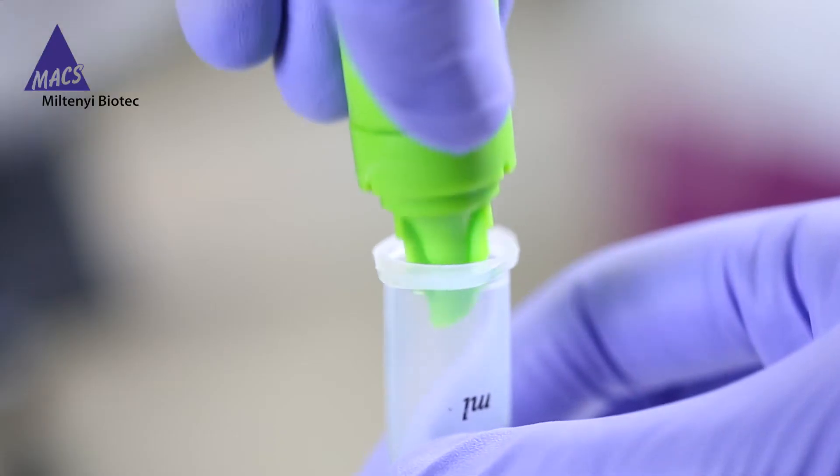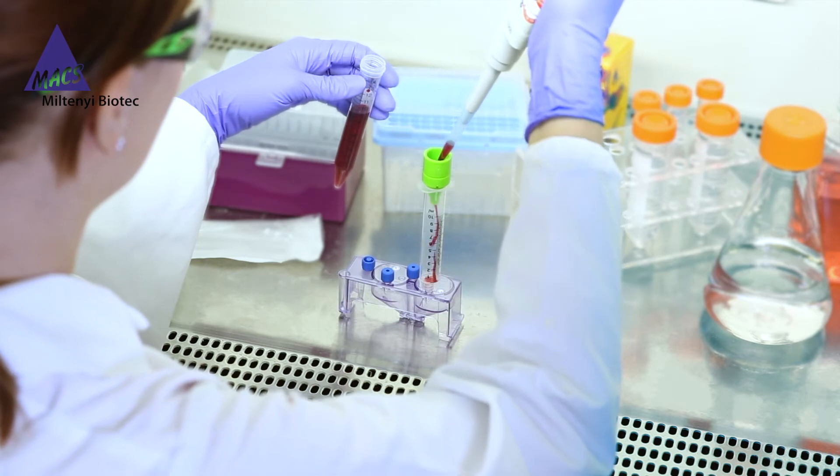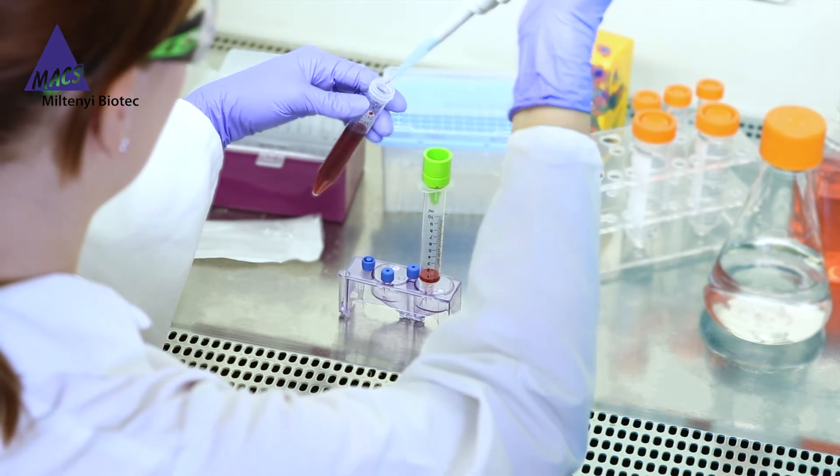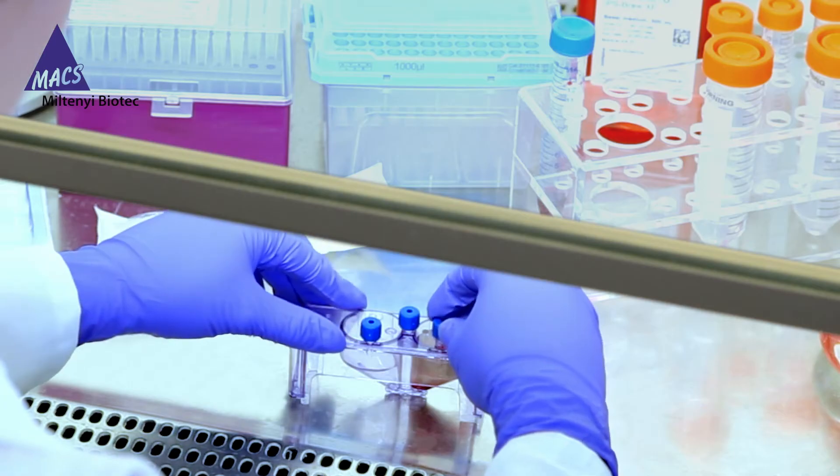Before the sample is applied, a pre-separation filter is placed on top of a syringe. To maintain sterility, you can load the cartridge under a laminar flow hood. The cap is screwed back on before removing the cartridge from under the hood.